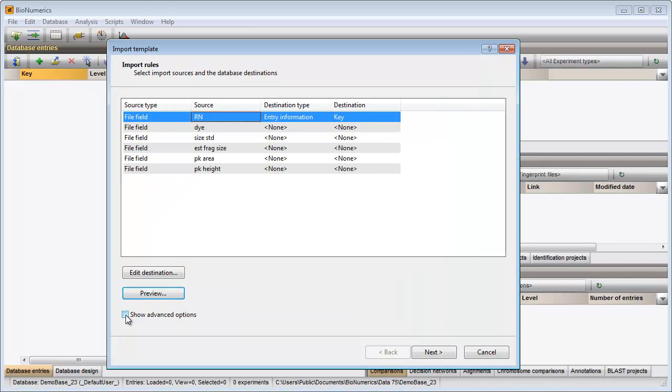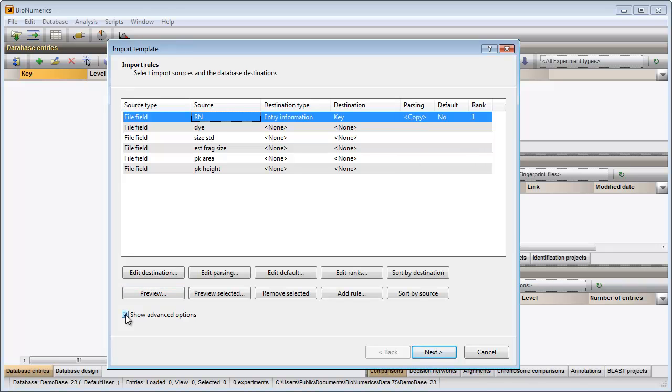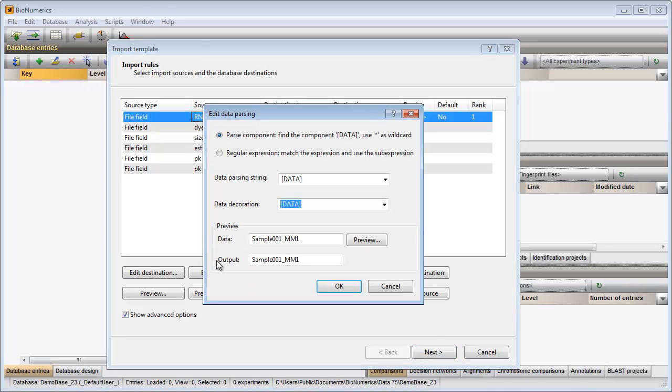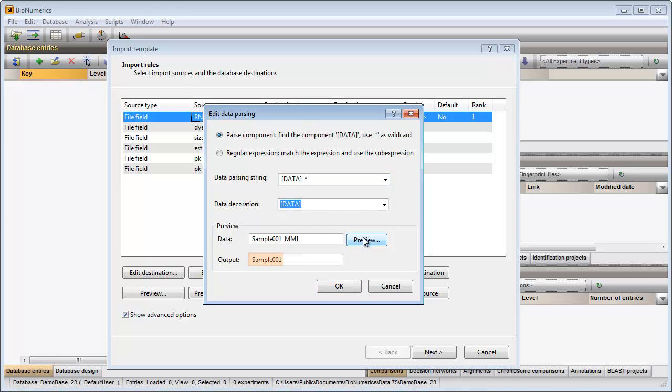I check the option show advanced options, I make sure the first rule is selected, and I press the edit parsing button. This parsing string will omit all text appearing after the underscore. The correct part is linked to the key field.